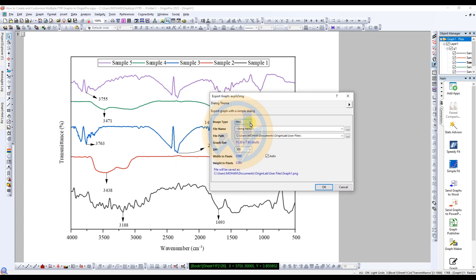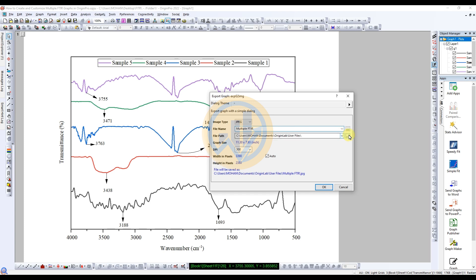There are many image type options. I selected JPEG format. If you want a publication-suitable format, you can select TIFF, BMP, or PNG. Enter the file name and select the file path location to save.